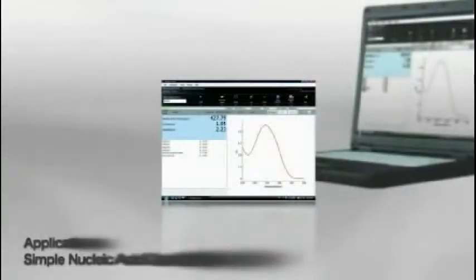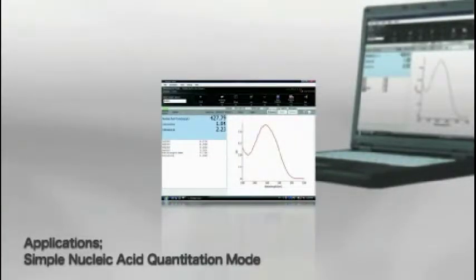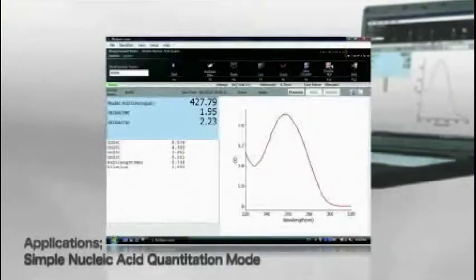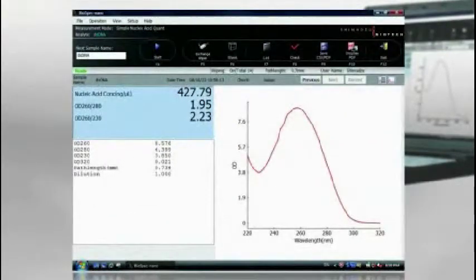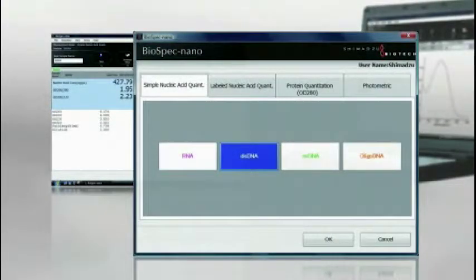In addition to nucleic acid quantitation and labeled nucleic acid quantitation, BioSpec Nano has protein quantitation and optical density measurement for a specific wavelength. This versatile unit will function in a multitude of analytical methods.